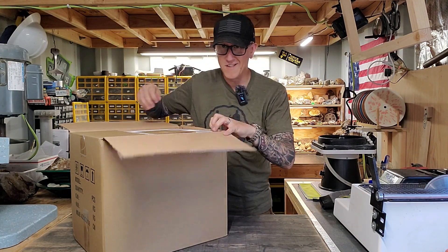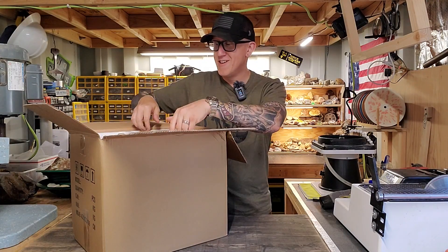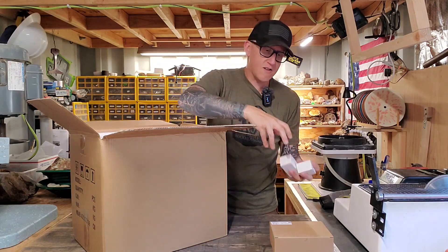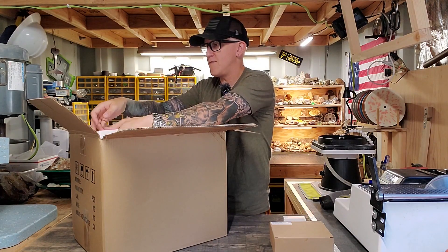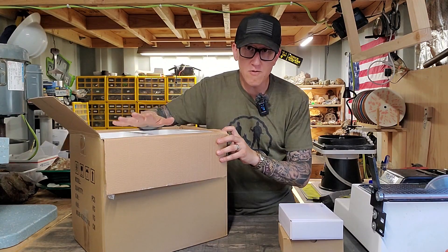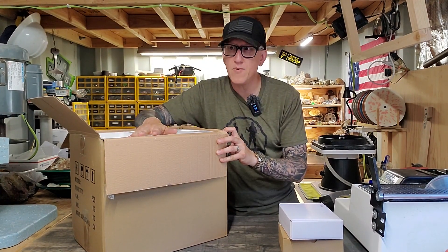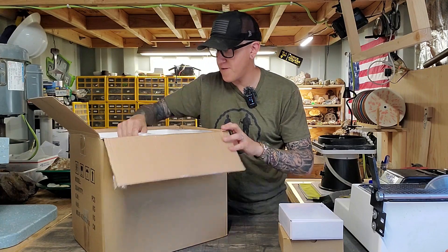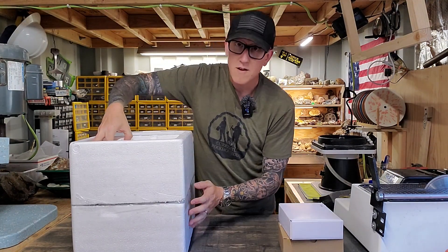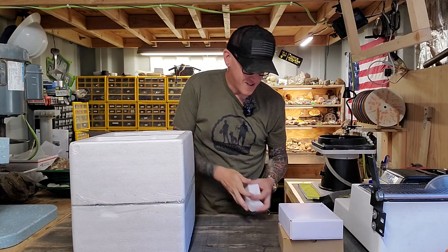Now I already know what this is — you guys don't know what this is. But this is something I've been very, very excited to obtain for quite some time. It is an absolutely critical tool in my opinion in mineral identification. So many little boxes here. It's like Christmas.